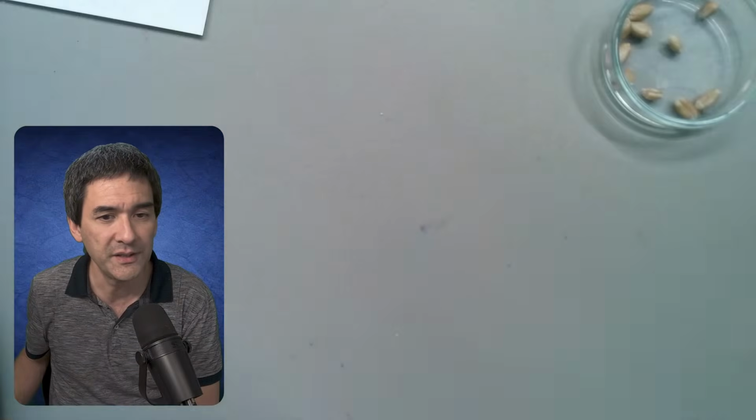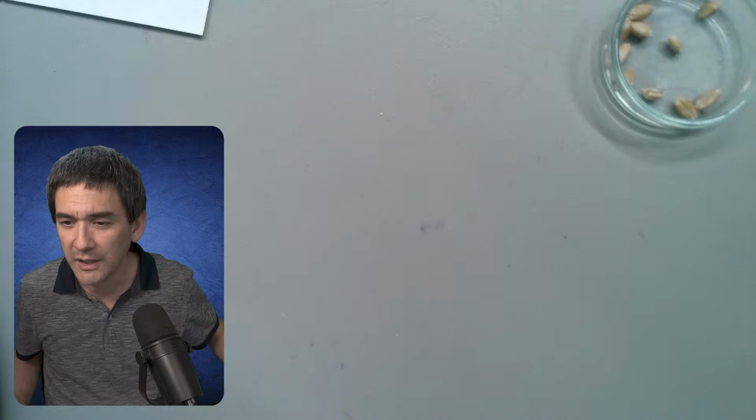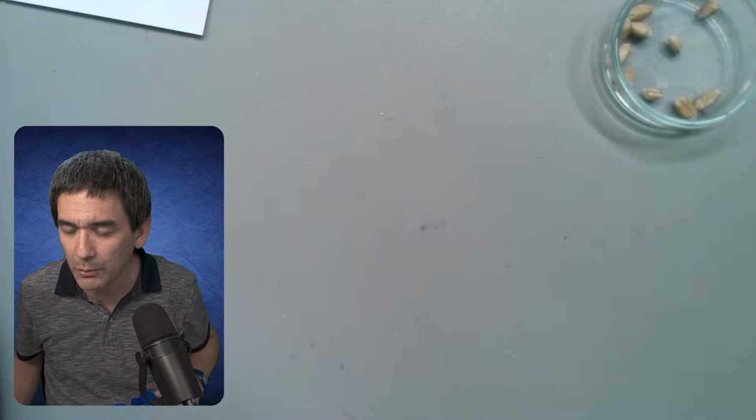Okay, so that's basically the thing here. And now, speaking of water quality, it would be interesting to know how algae affect that. Perhaps different types of algae would mean different things. You could look at some of the samples too for a future video.